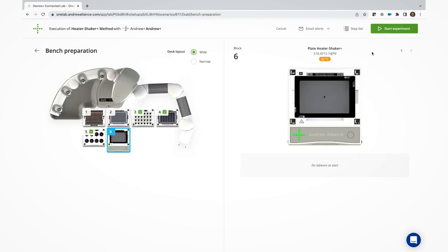You'll see that a Heater Shaker Plus has been selected thanks to a dedicated icon. So, are you ready to power up your lab? To learn more about Heater Shaker Plus and discover our other connected devices, visit waters.com/Andrew Alliance.